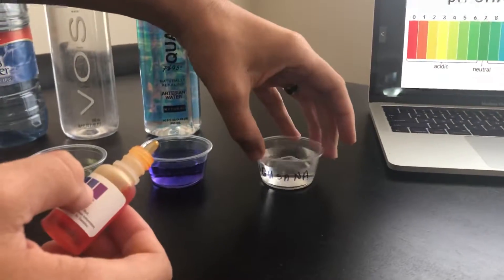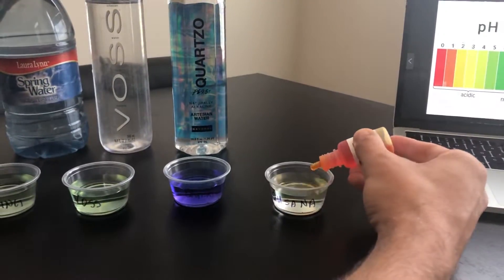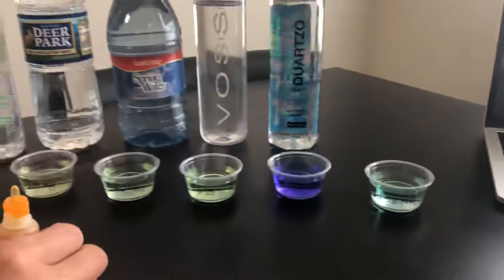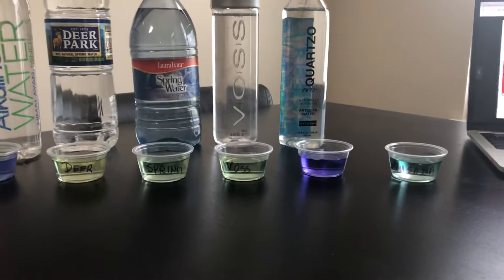Last but not least, this is our home water filter system, and it's a little bit higher than the spring waters because it's a little bit more bluish.